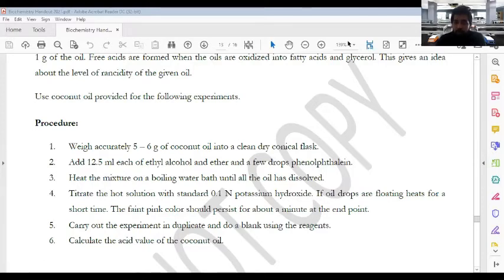You know that organic solvents can easily catch fire. Okay, yes, okay. Then after that you have to boil that to mix it well. And if we do not provide heat here, there will be two layers.